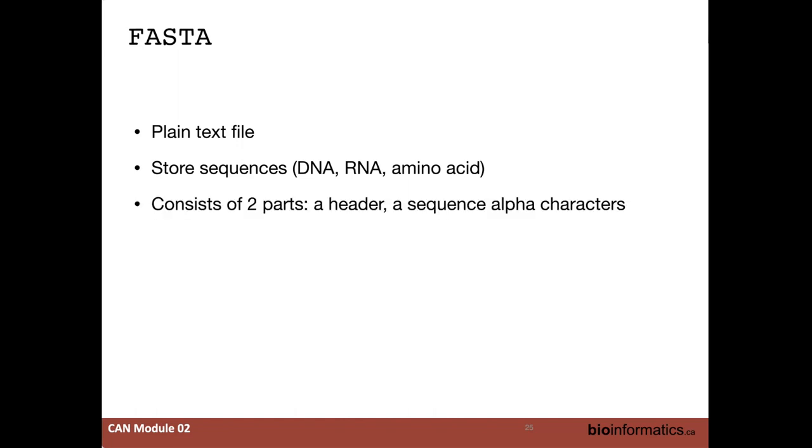Okay. So lucky for us, most FASTA files are just plain text files. There's nothing special about it. It's just plain text with some ASCII characters in there. We can store sequences, either DNA, RNA, or amino acids. Most of the focus is going to be on DNA and RNA. DNA for this particular section, and RNA, you guys are working with after the fact.